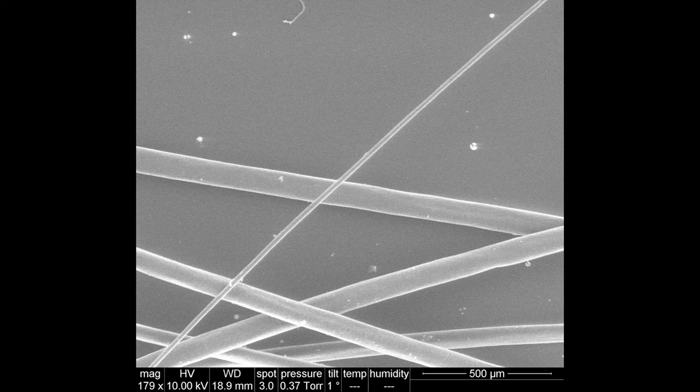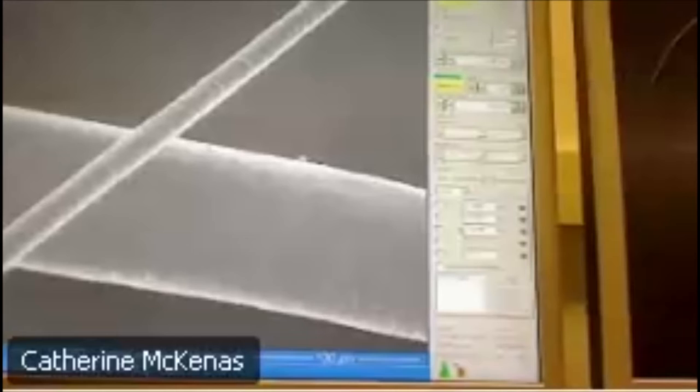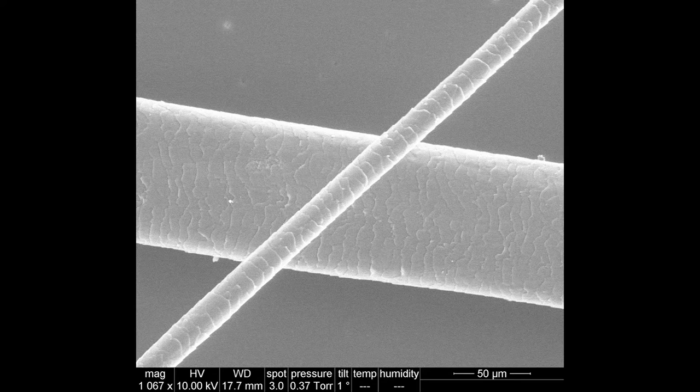And so we're taking an image right now showing Mr. Gat's hair and the cat's hair, kind of right there. We'll zoom in now. Once we focus it, y'all should be able to see the structure of the cuticle on the hair. Okay, so this is the cat's hair, kind of in front, and behind it is Mr. Gat's hair. You see that the cuticle looks pretty similar in each. In reality, a cat's hair is supposed to be much more rigid than a human's hair, but right now they look pretty similar.